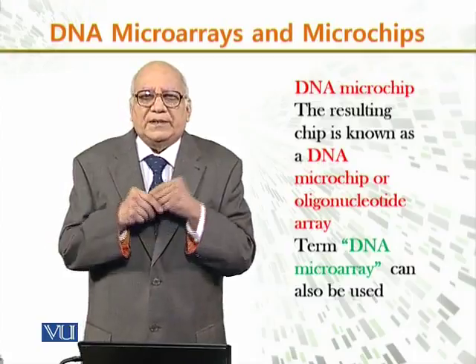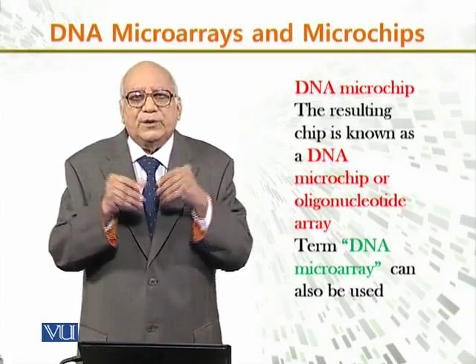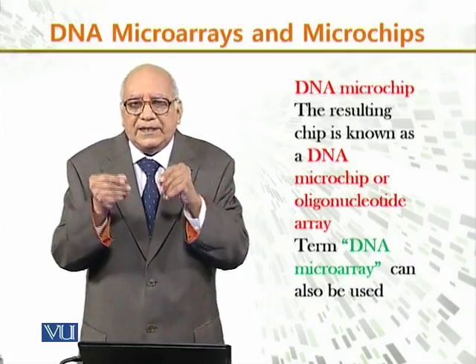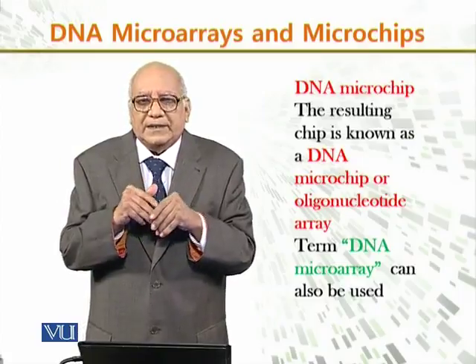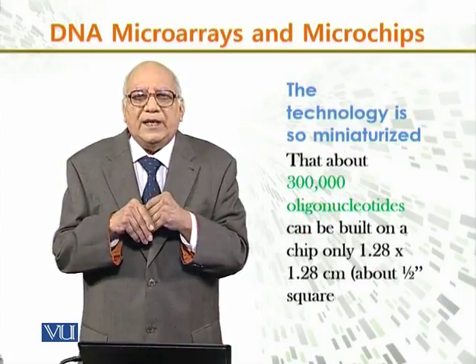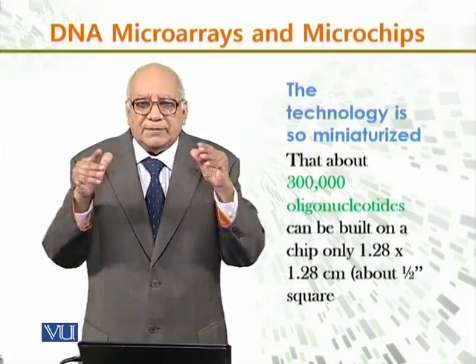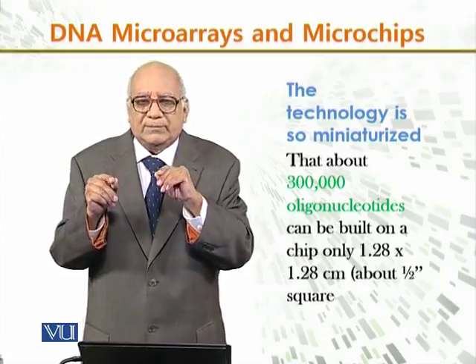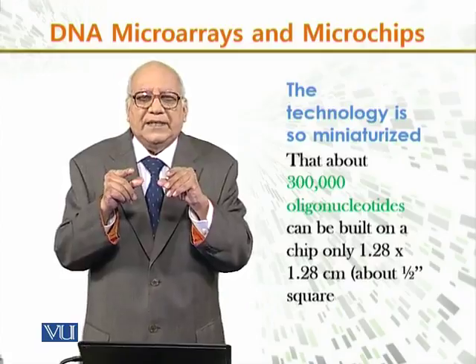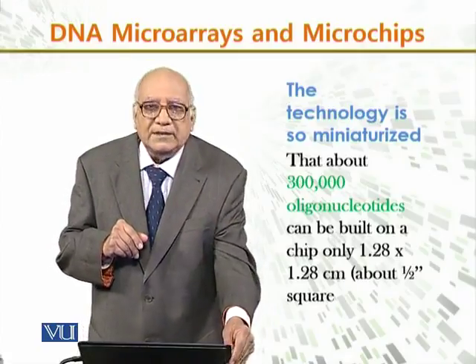The resulting chip is known as a DNA microchip or oligonucleotide array, because they are all arranged in tiny spots on a tiny slide. The term DNA microarray can also be used for the DNA microchip. This technology is very much miniaturized. Think about it: about 300,000 oligonucleotides can be built on a chip only 1.28 by 1.28 centimeters, about half an inch square. Imagine such a small area where you can analyze about 300,000 oligonucleotides in one go.